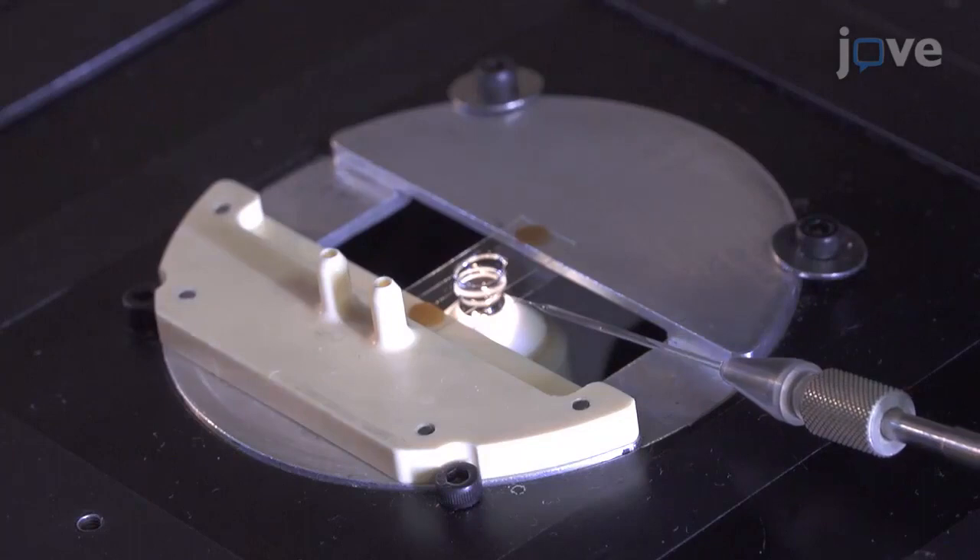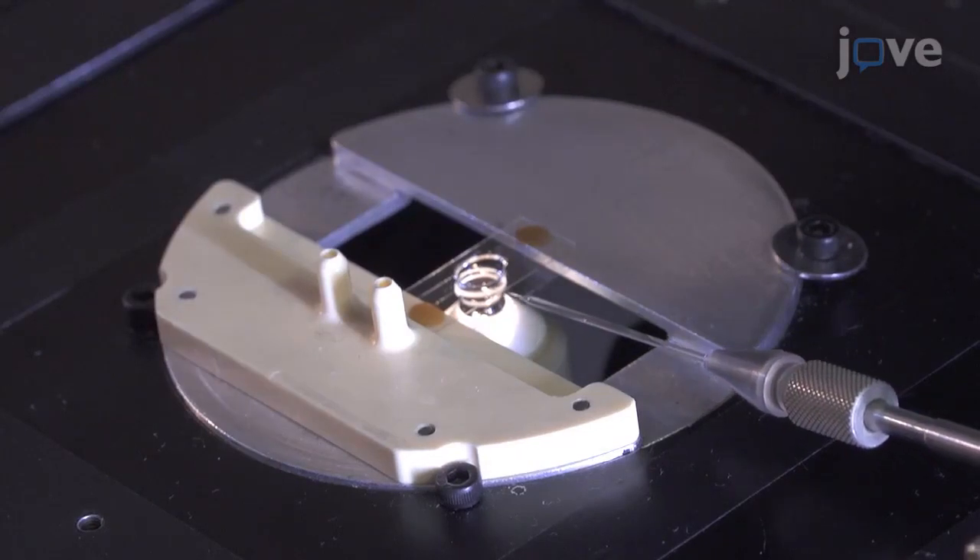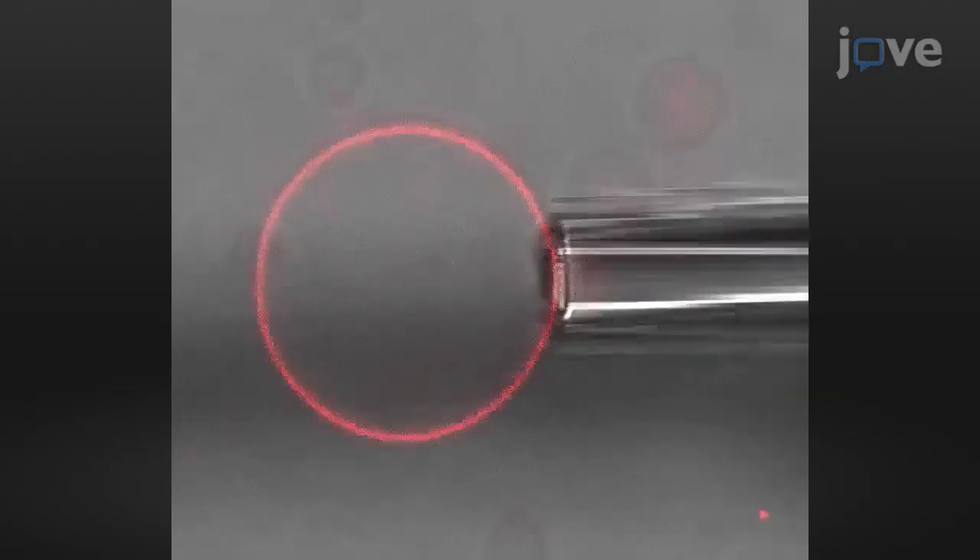This protocol facilitates a reliable measurement of the membrane mechanical properties of synthetic hybrid polymer-lipid vesicles using a micropipette aspiration technique. This is the only technique that allows the membrane flexibility and its ability to be stretched to be assessed in single experiments.